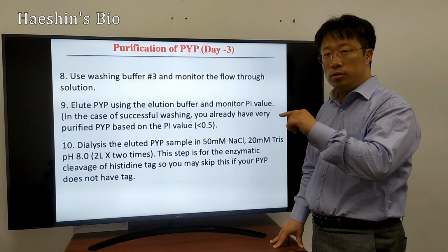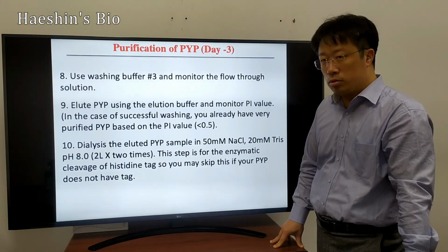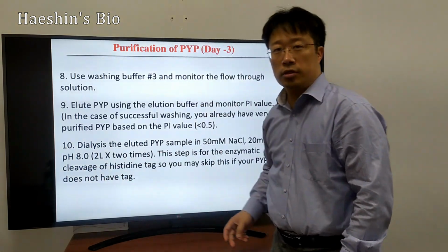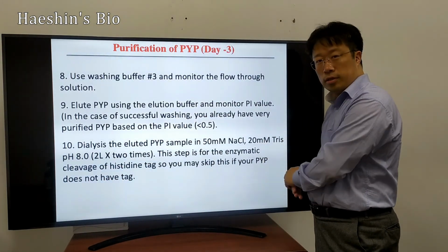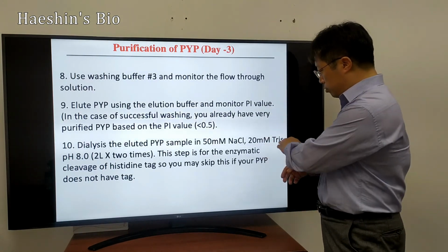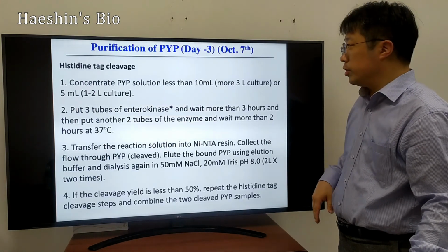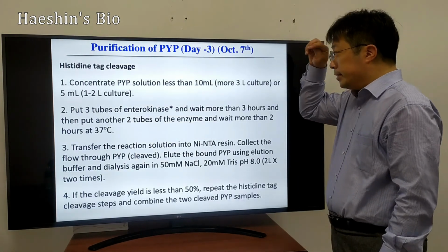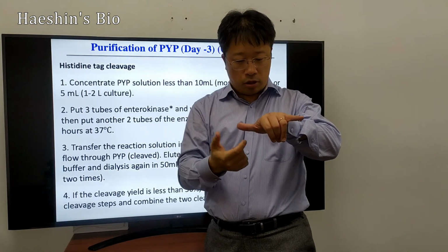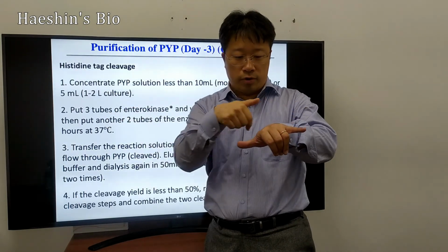If you forgot that part, it's better to go back to protein purification part number 3. I already explained that part there. So anyway, you have to do that cleavage experiment. You need some tris buffer there. So that's why you have to change from the sodium phosphate buffer system to the tris buffer system. And then also you remove the imidazole solutions. So now that's why histidine tag cleavage. Now you have PYP, the target protein, and there's a tag. You put in enterokinase. Basically you cleave it, and then you will purify this one.